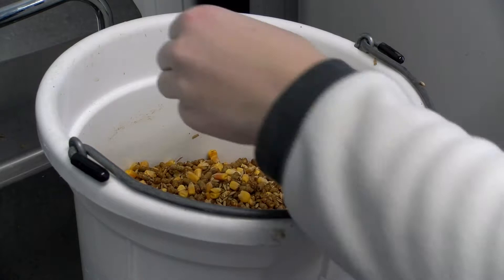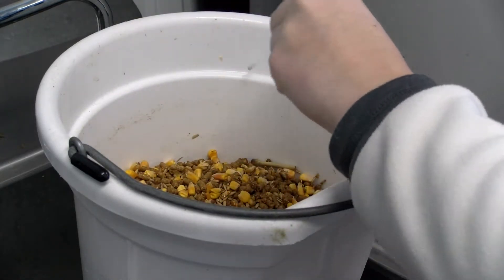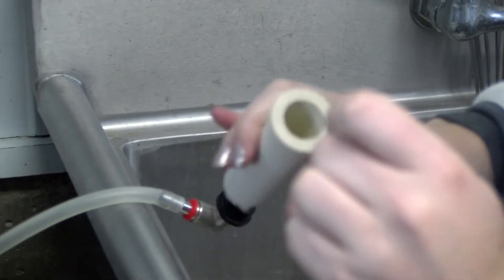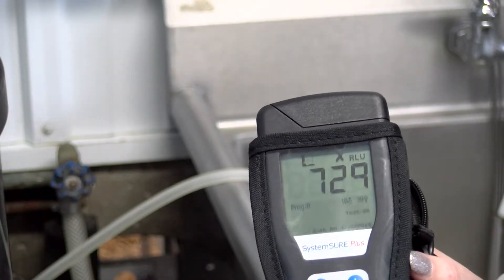In recent years, Dr. Donald Socket, DVM with the Wisconsin Veterinary Diagnostic Laboratory, has been working to adapt ATP usage to on-farm calf sanitation audits. The work by Dr. Socket has allowed farmers to identify problem areas on their farm and address them.